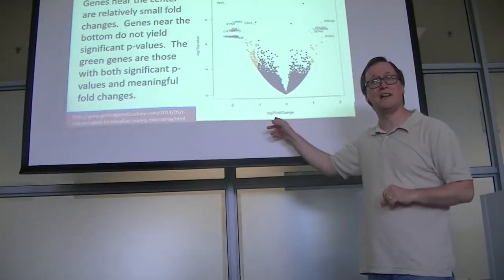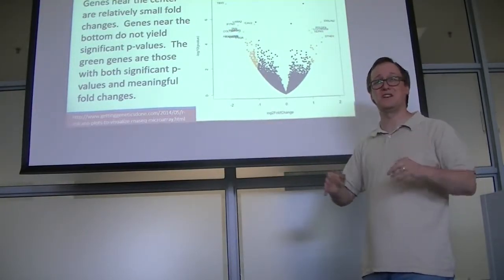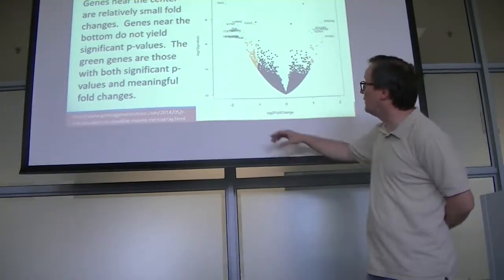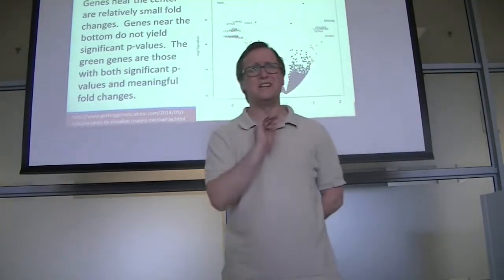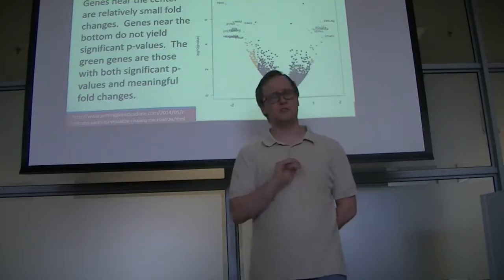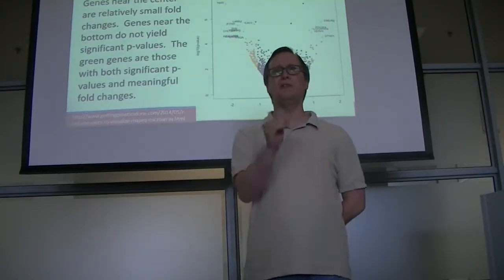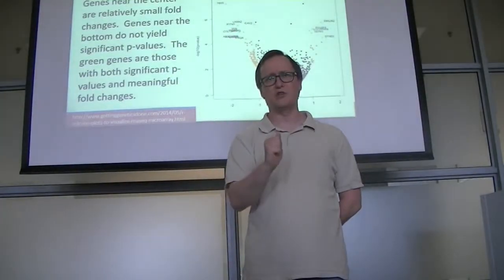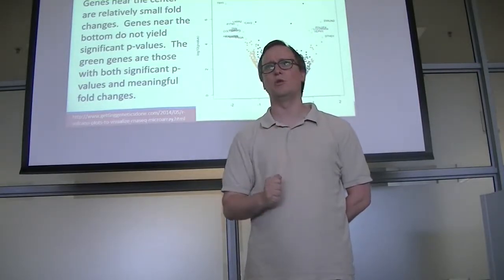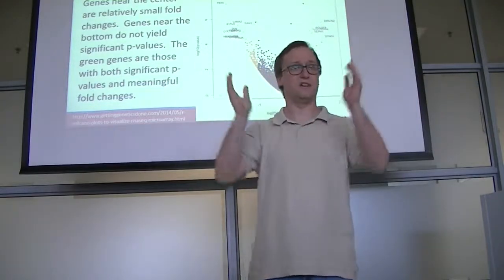The Volcano Plot is another example of a visualization that people use all the time in differential gene expression. So we're going to spend a lot of time talking about p-values in just a moment, but for now, I want you to just evaluate that a low p-value for us is the suggestion that this gene is differential between two cohorts. All right, this is a hit for us.